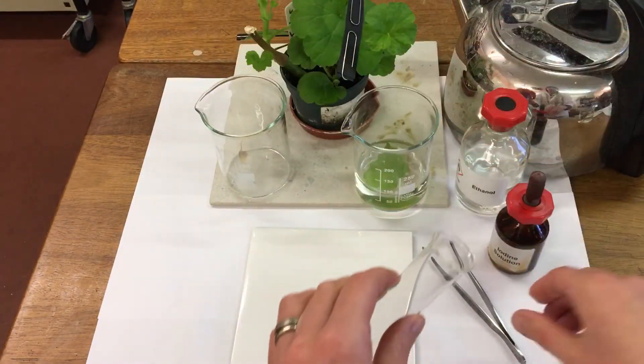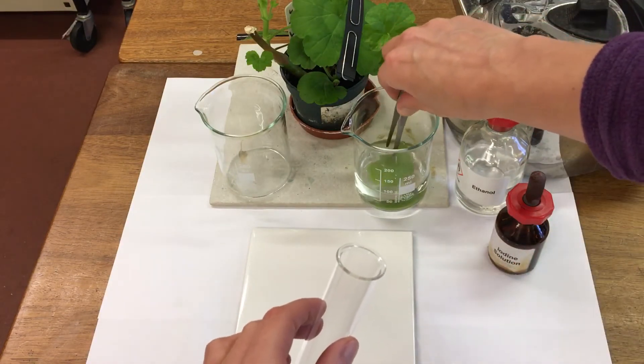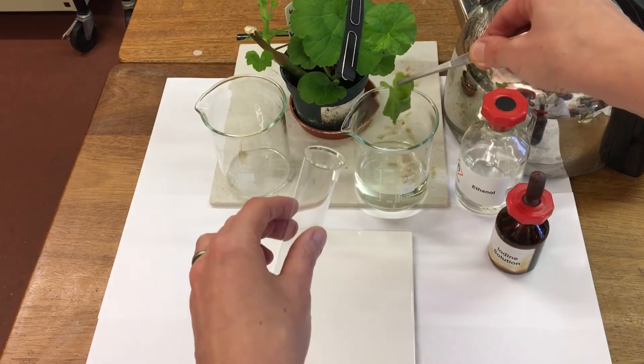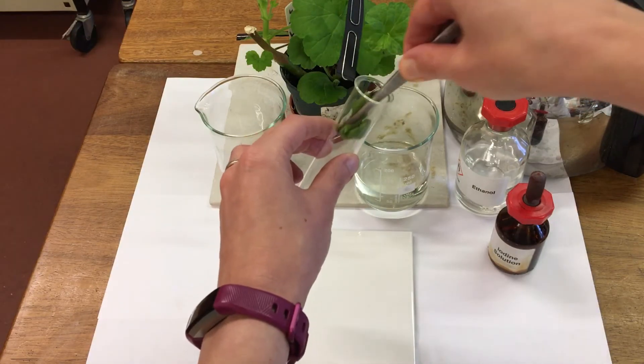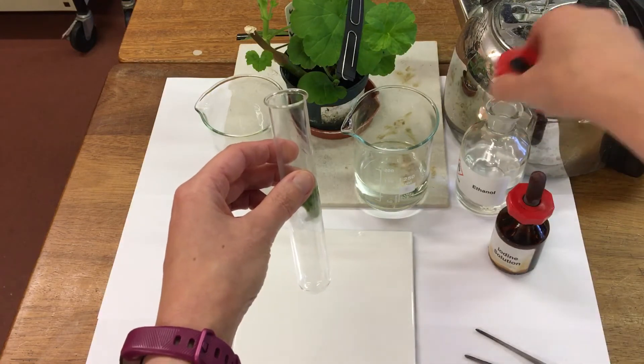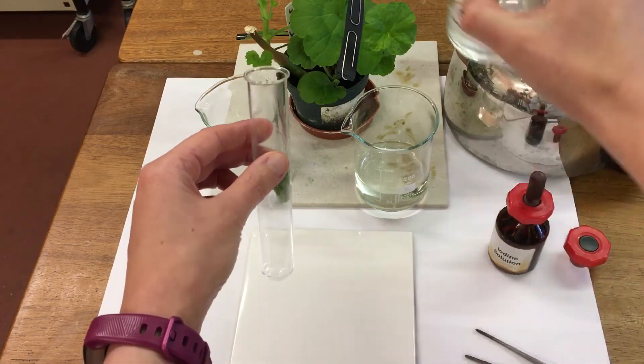The next part is to pop our leaf into some ethanol. So we're going to take the leaf, which you can see is much floppier, and we're going to add some ethanol.